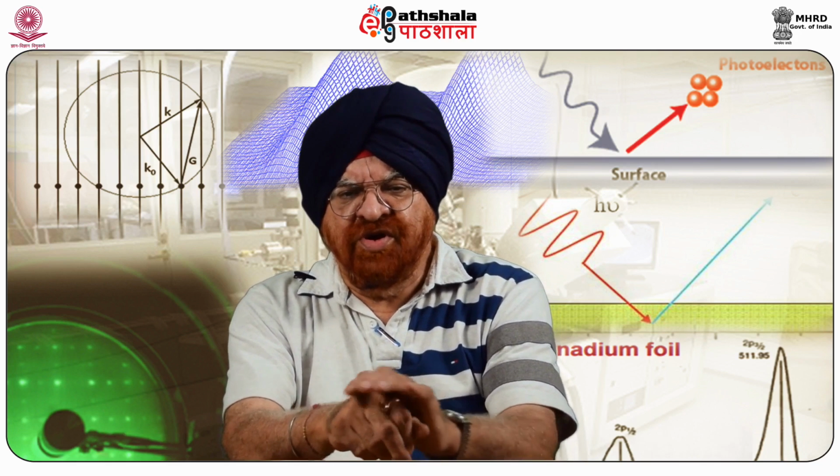The major feature learned here is that the energy of a photoelectron emitted from a core electron is a function of its binding energy and is characteristic of the element from which it was emitted. This is a very important point which one has to understand.